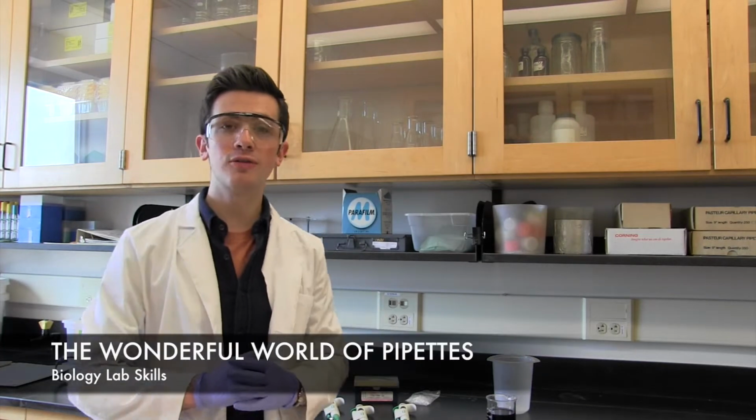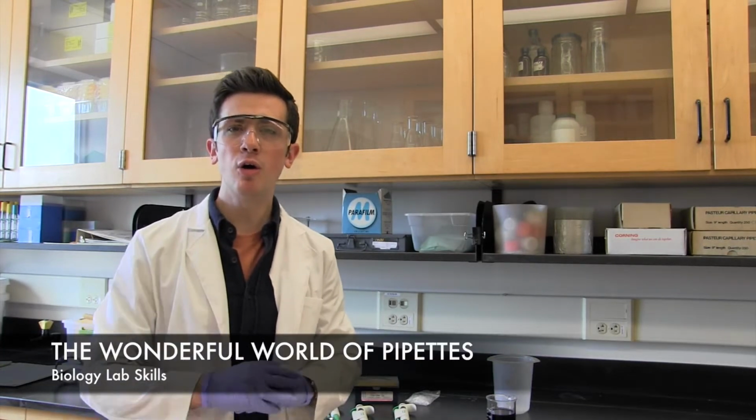Hello and welcome to the wonderful world of pipettes. You may already be somewhat familiar with pipettes, micropipettes, and pipettors. However, there's a lot of subtle nuance that goes into using these instruments, so we want to make sure you're fully prepared for your biology skills laboratory.